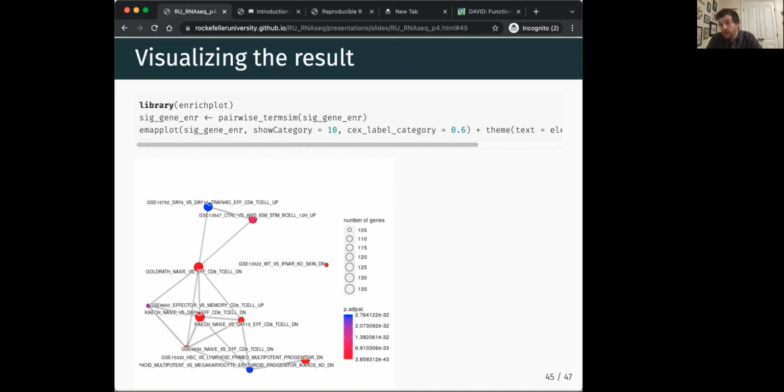At that point, if you have a lot of ties in your statistic, maybe try doing LFC shrink. That might be a way around it. But if it's just a couple of ties here and there, it's not too big a deal, whether it does it by just randomly assorting them. It shouldn't affect things.